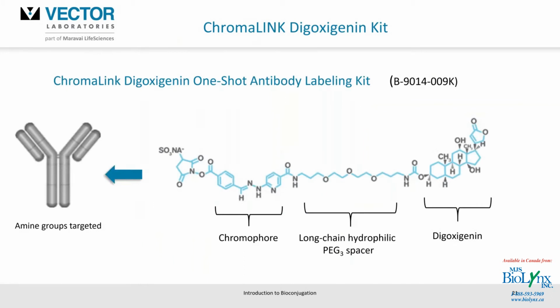Okay, this brings us to the Digoxigenin kit. Very quickly, here's the dig over here that'll be bound by an anti-dig antibody. Incorporated here is this long chain hydrophilic PEG spacer, performing very similar solubility roles that I mentioned earlier for the biotin. Here's this particular chromophore again to enable quantification with that quick UV scan. And here's the reactive group that'll bind to your amine groups on the antibody. So this particular kit, the Digoxigenin antibody labeling kit, allows you to link the Digoxigenin onto an antibody, for example.